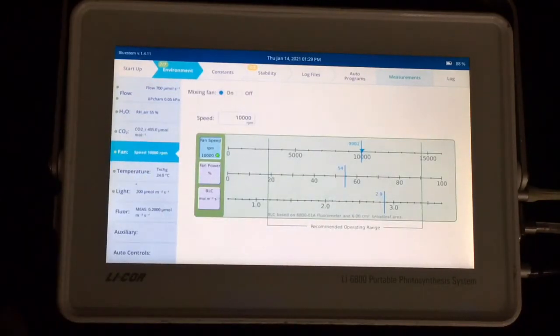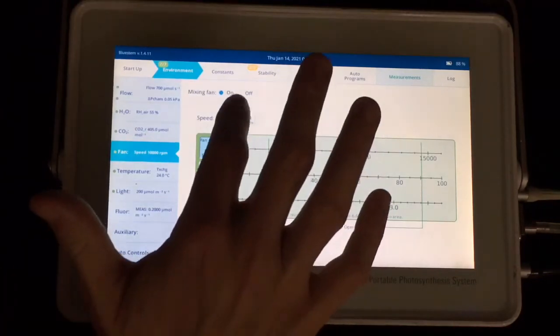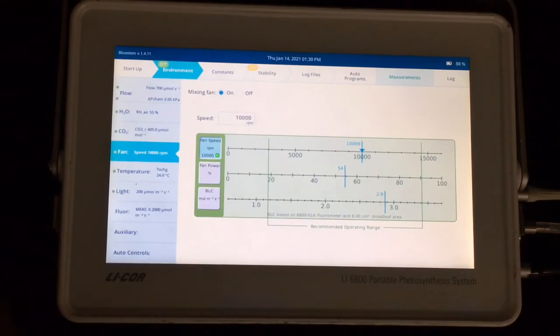Fan speed, this controls the boundary layer conductance, which we want to be as high as possible for a better estimate of stomatal conductance. And a typical choice is about 10,000 rpm, which will really strip that boundary layer.